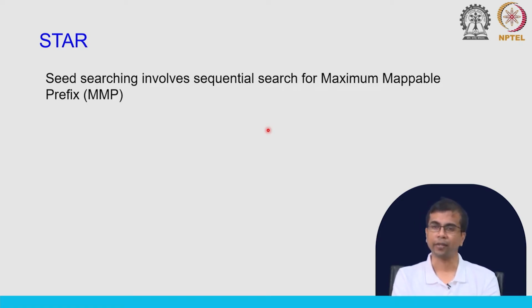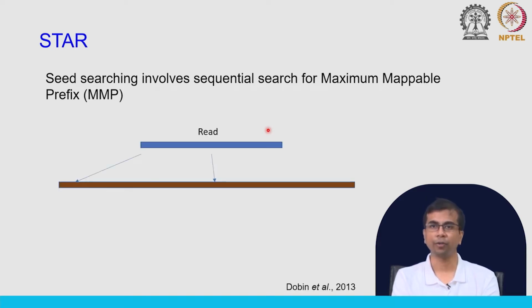Okay. So, how does this actually differ, and how can it incorporate this split alignment? Here is the read. What this method does, it starts with the read. It will start from this sequence in the beginning, and it will try to find a part of this sequence, or the seed, in the reference genome. So, this brown is the reference genome, and let us say it finds this seed somewhere here. Once it finds a seed in the reference genome, it will start extending, stitching and scoring.